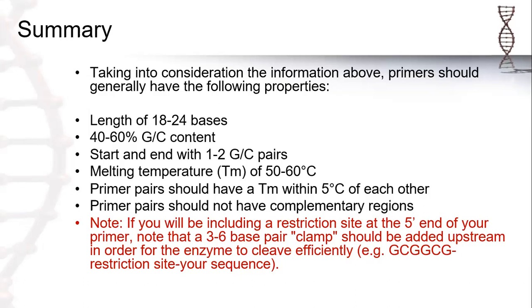And these are some basic guidelines or tricks you must know about designing primers or learning about how primers work. These are the optimum conditions for designing good primers. These conditions may vary. If, after designing the primer, your experiments fail, you can check the primers again according to these conditions and the region you want to amplify, and you have to check that.